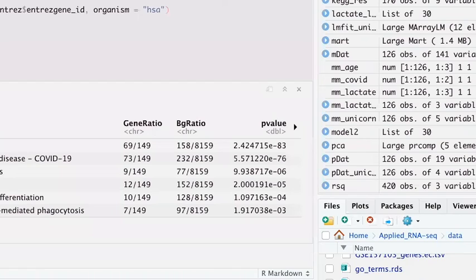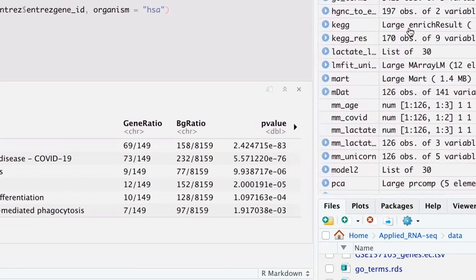Okay, I'll just share this again. So if I try to do KEGG dollar, you'll see that nothing's coming up, because usually you'll just put in something and tab, and it'll come up. I think it's the way that the data frame is made. So KEGG, it's an enriched result. So it's not a data frame. It's not a typical structure.